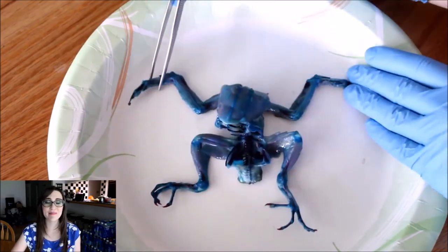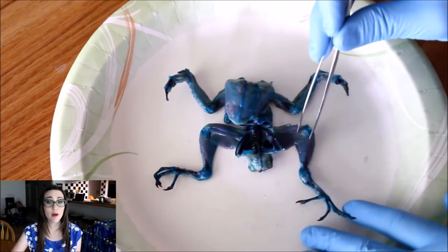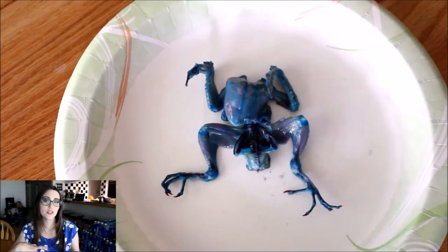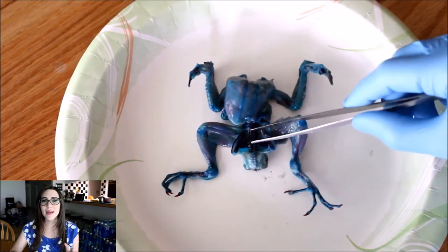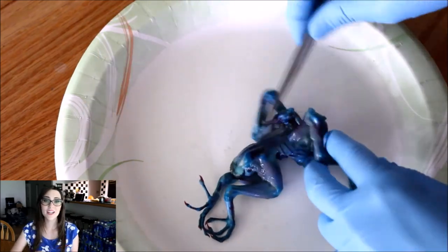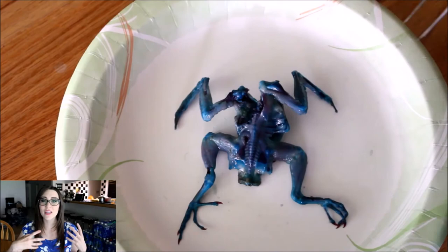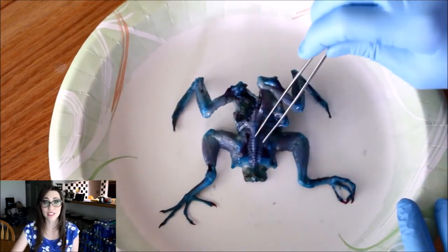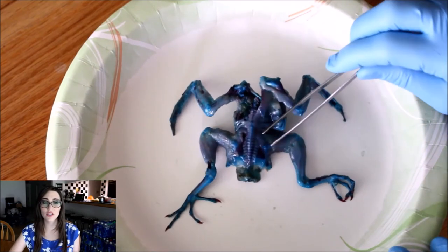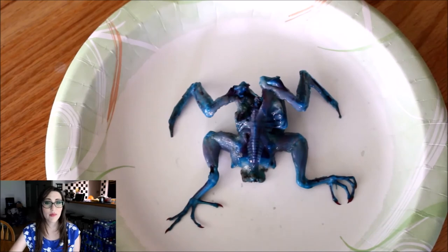So in conclusion, I feel that my bird has come out pretty well so far. I'm excited to move on to the next clearing and bleaching step. However, the bones are quite a dark purple — I'm going to say that they're a little bit overstained. I was looking for more of a reddish pink color, but that's okay. We'll really see what the bones actually look like and what the color truly is once we start clearing and bleaching them. I think that if I ever get a hold of another bird, I won't leave it in the cartilage stain or the alcian blue stain for as long — about two days. I'll leave it in there probably about one day or less.